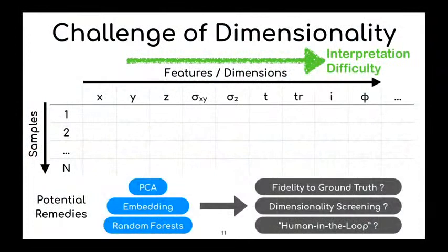We see that point clouds can have spatial coordinates in the x, y, and z dimensions, but they can also have additional dimensions that can be directly measured in experiments or through post-analyses. These include localization precision, timestamps, trajectories, intensity values, and even molecular orientations. How can we faithfully view all this information at once or in a logical way?